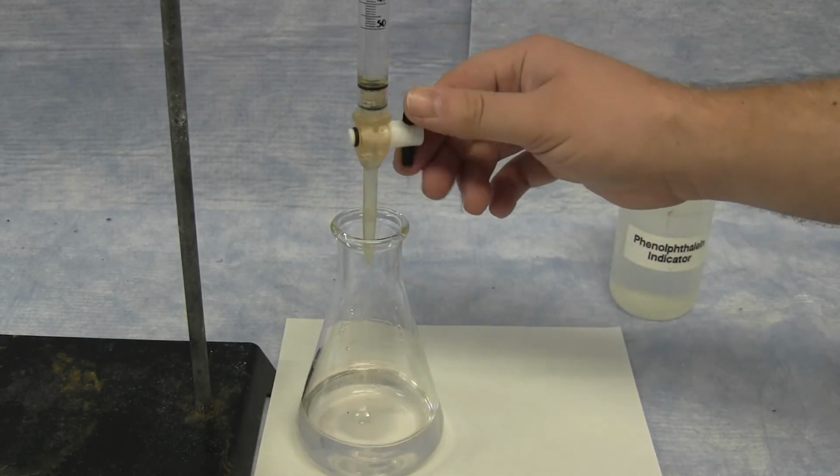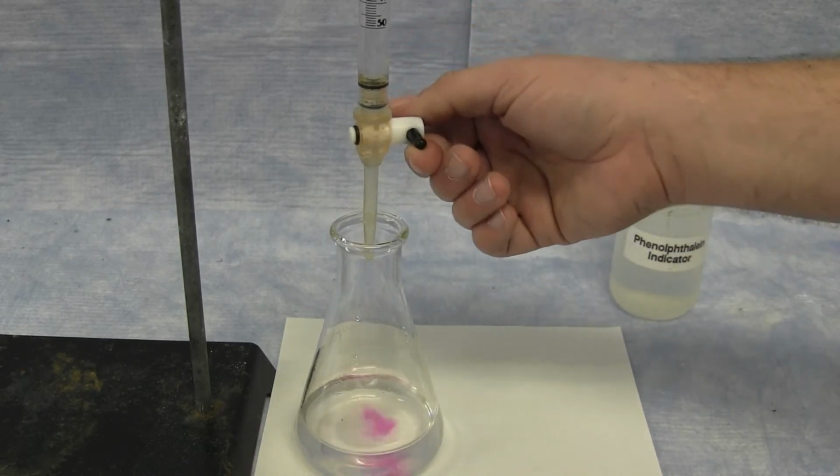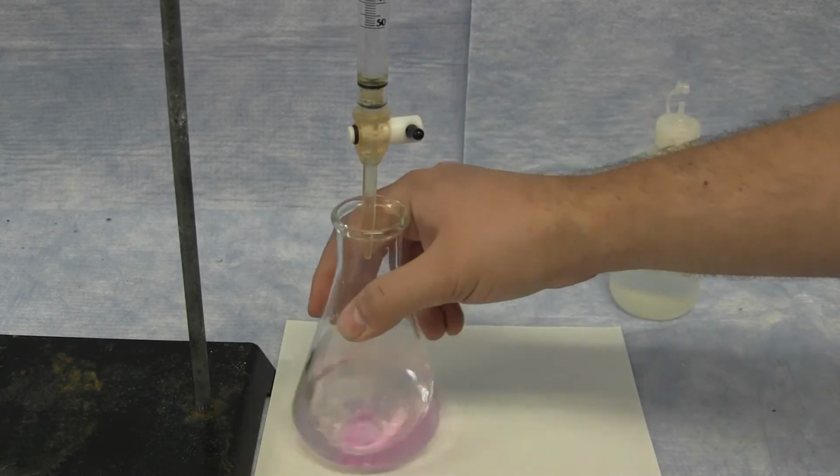The pink color should remain for approximately at least 30 seconds to a minute, and at that point, you can consider the titration complete.